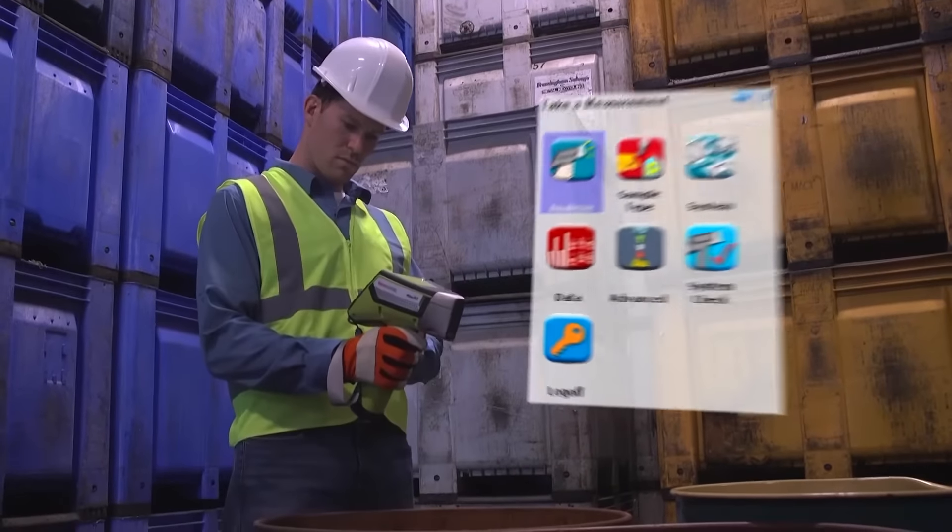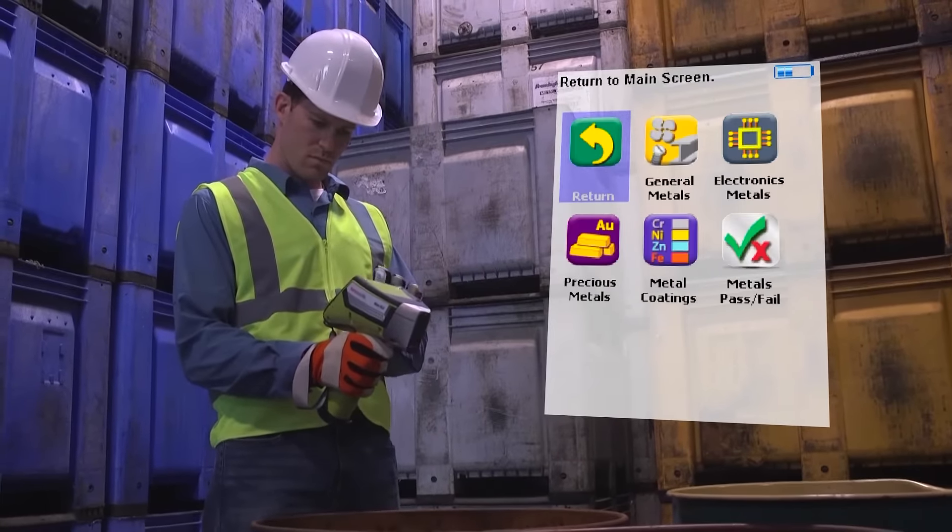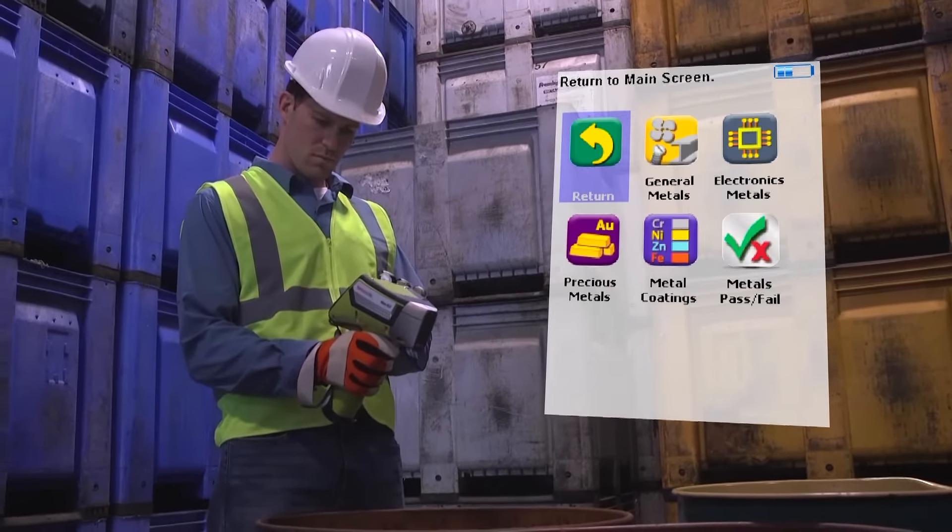A simplified application interface enables non-technical users to operate the XL2 Plus. Touchscreen functionality or optional directional keys make navigation and data entry on the Niton XL2 Plus a breeze.